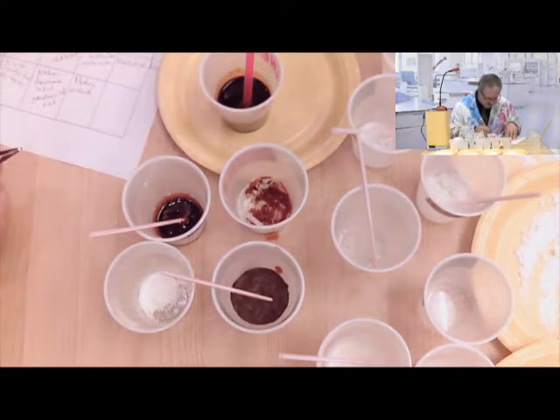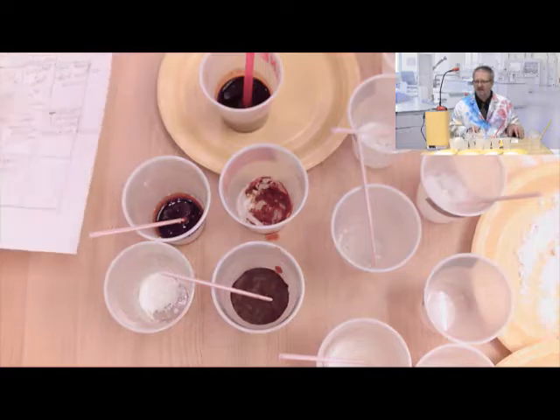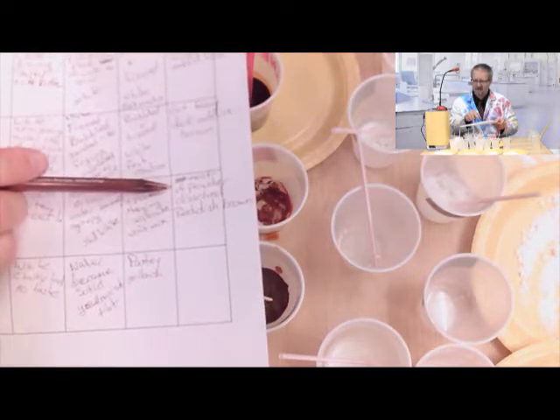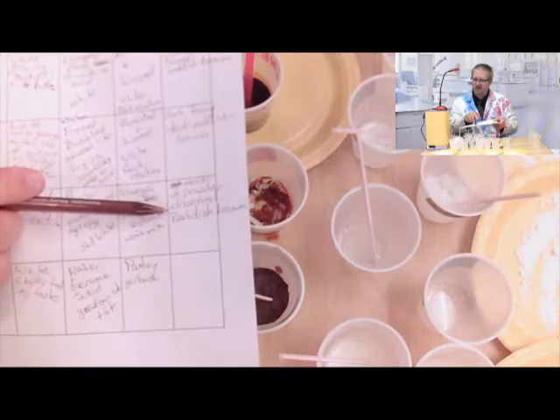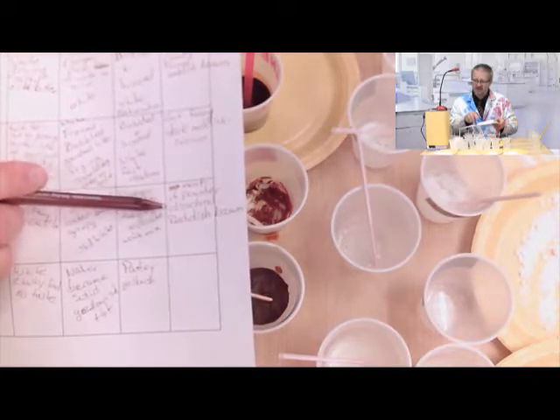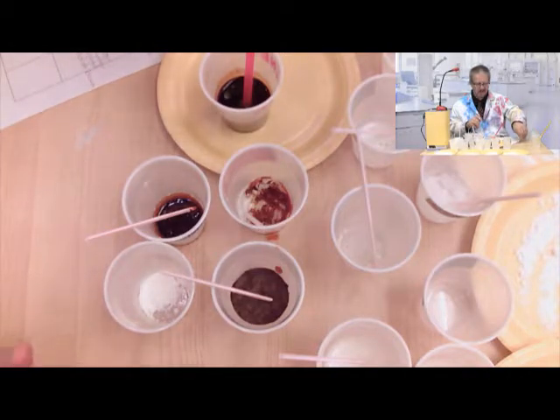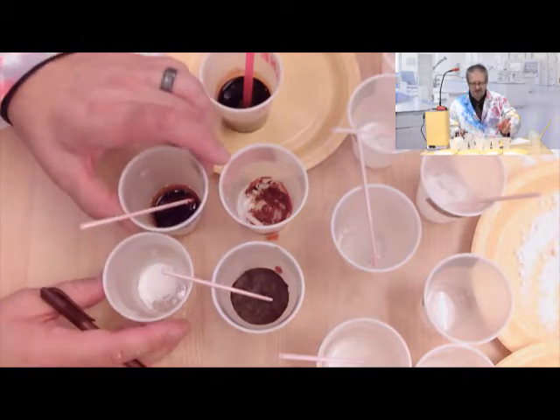And that's about it. Okay, not a whole lot of change there. So here's my notes for powder C. Most of the powder dissolved. It turned reddish brown. Okay, last one.